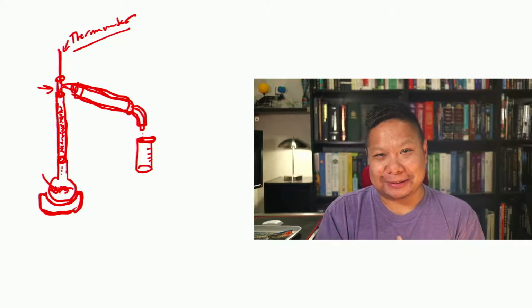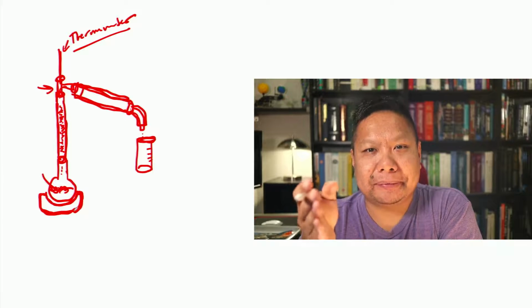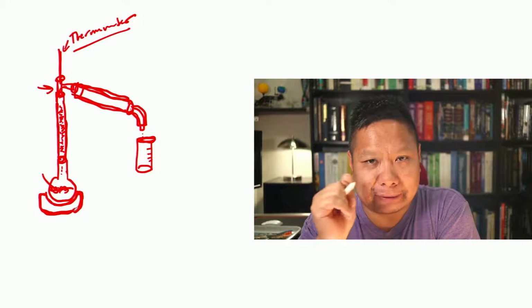He's holding the flask, right? And it's on fire, and we were all like, what do you want us to do about this? Because it's on fire. And as cool as a cucumber, he takes it over, puts the flask into a wooden box and closes the wooden box. So it extinguishes the flame, of course, but that's just a story to reiterate the fact that you shouldn't use an open flame with any kind of organic reactions, right?